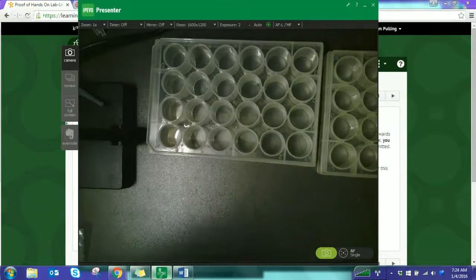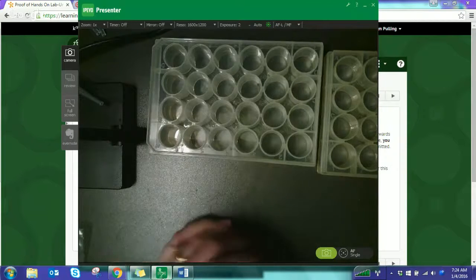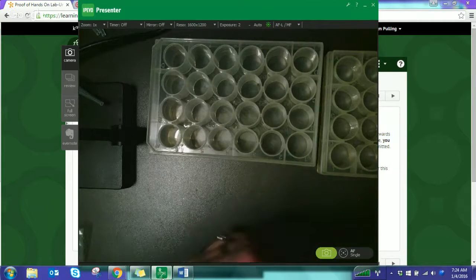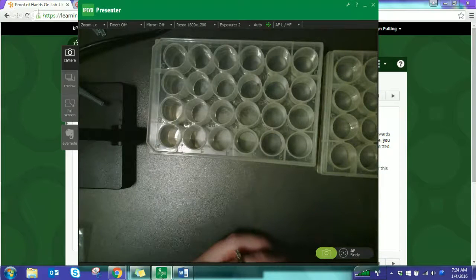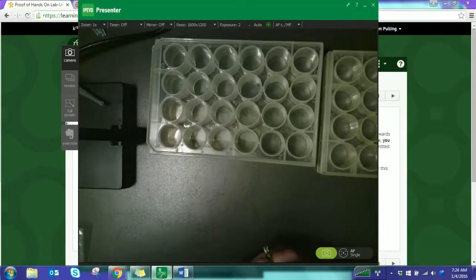So that second vial, go ahead and get that one open. So again, pop off that seal on the top. You got nails, you might be able to rip it off, otherwise you might just have to puncture it, which isn't exactly the easiest thing in the world either.